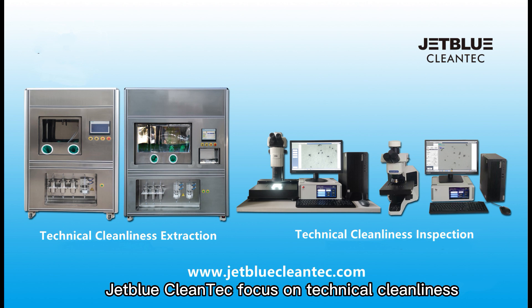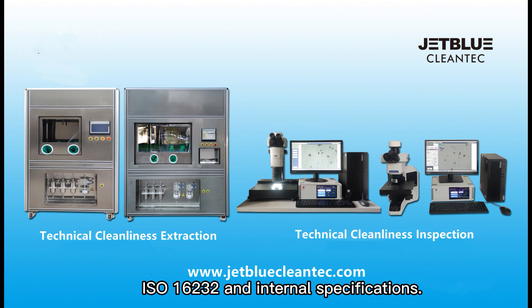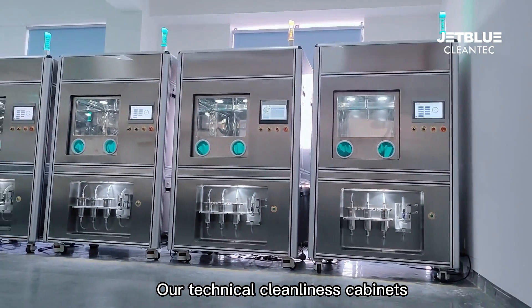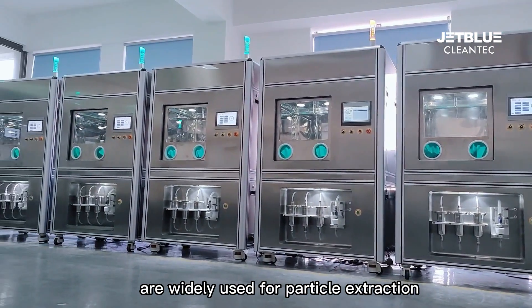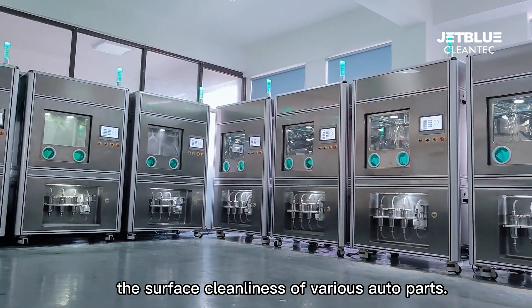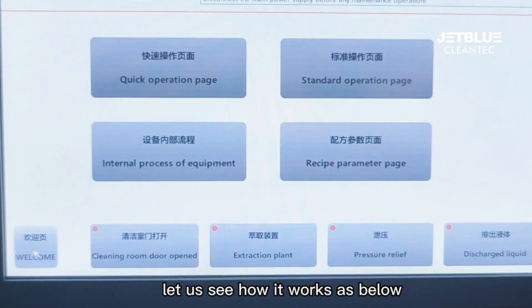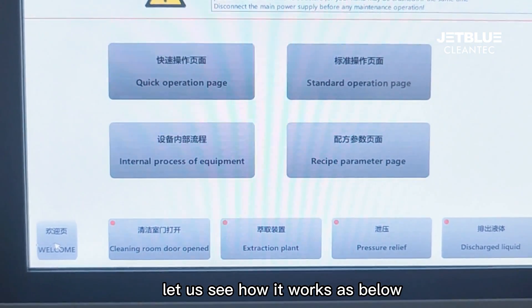JetBlue CleanTech focuses on technical cleanliness inspection and extraction systems according to VDA19, ISO16232, and internal specifications. Our technical cleanliness cabinets are widely used for particle extraction and sample preparation when testing the surface cleanliness of various auto parts. Let us see how it works below.